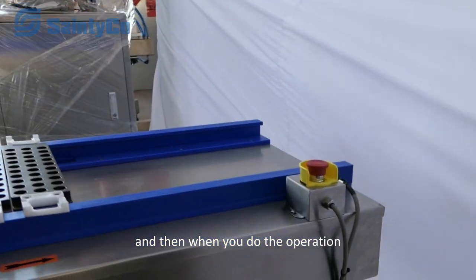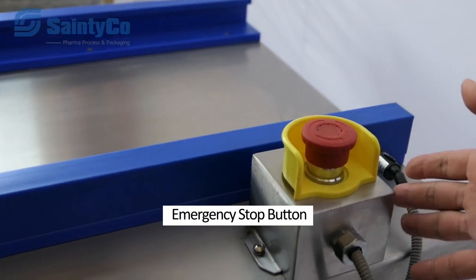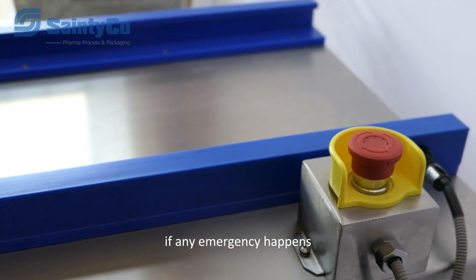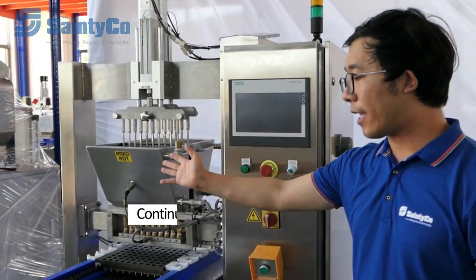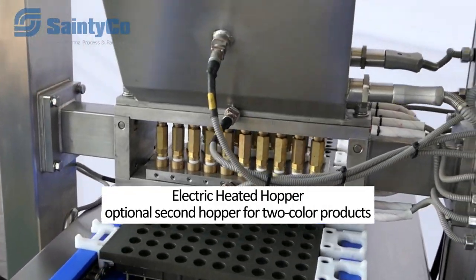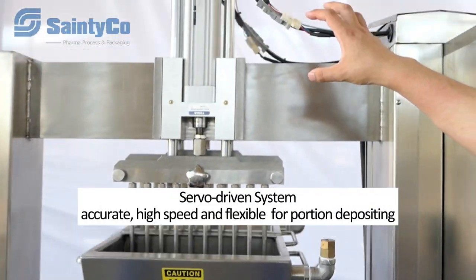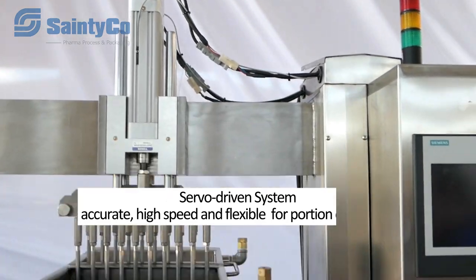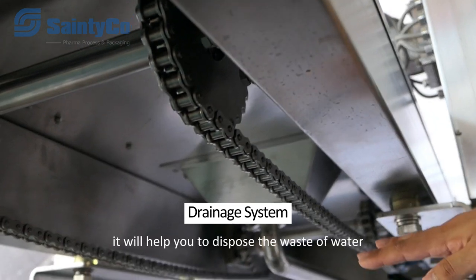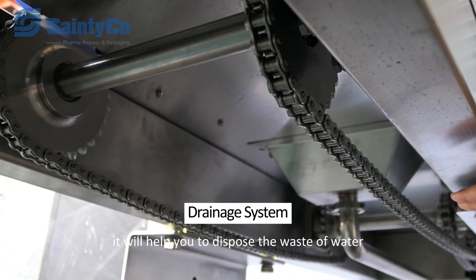During operation, there is an emergency stop here to protect staff if any emergency happens. We also have the index conveyor, hopper, and servo depositor system. At the bottom, we have a drainage outlet to help dispose of wastewater.